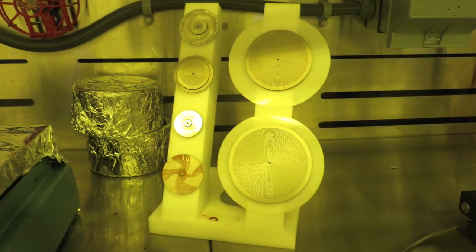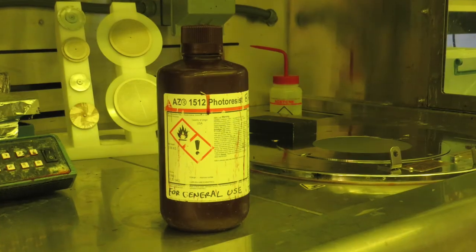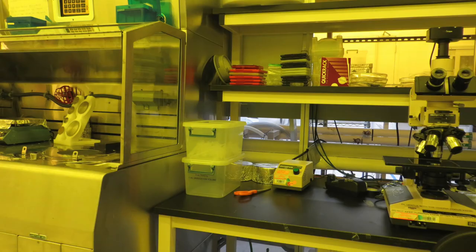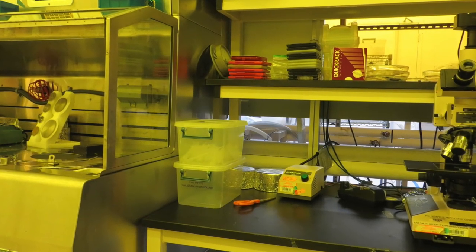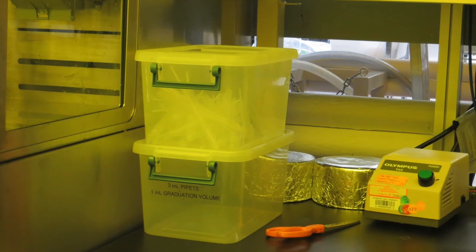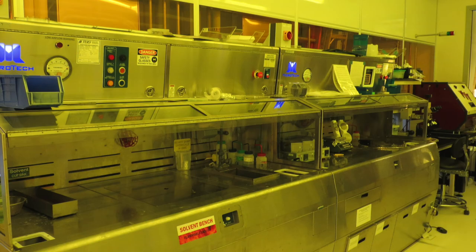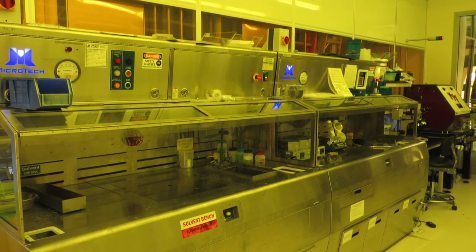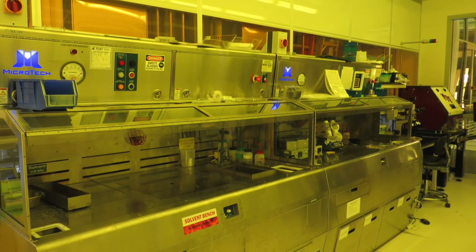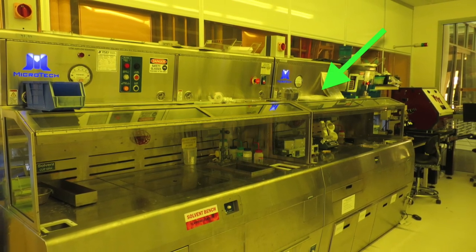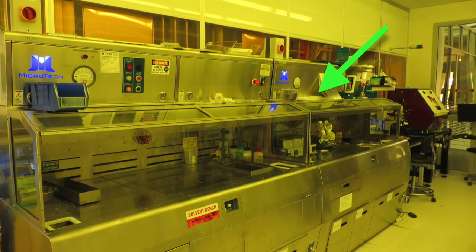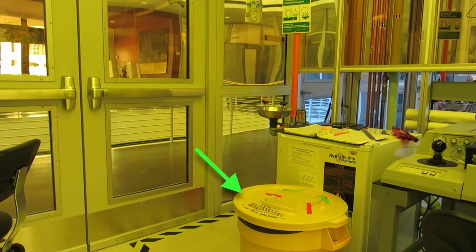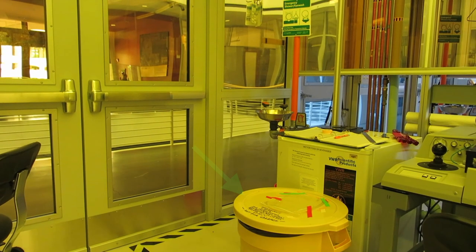These are the chucks that we provide. We also provide AZ1512 photoresist which is a good general purpose positive photoresist. And in these bins to the right are some disposable plastic pipettes which we use to dispense the photoresist. When you're done using the spinner you'll probably have some foil and wipers with photoresist or acetone on them. You should take that waste and put it in the ziplock bags which are up on top of the cabinet. And then the sealed ziplock bag goes into this yellow dumpster where it is disposed of as hazardous waste.